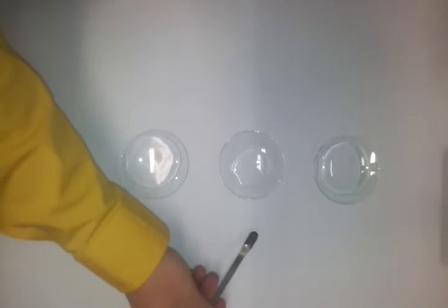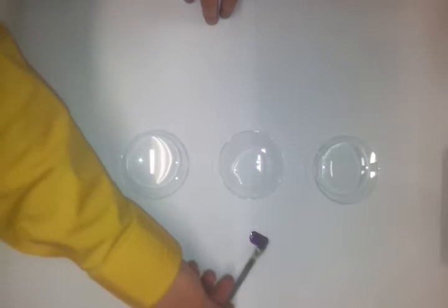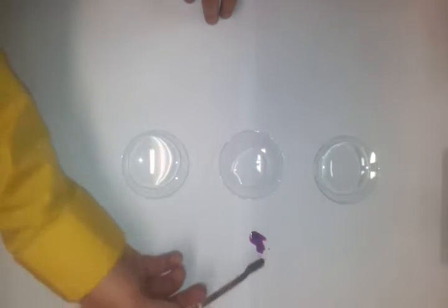Spread that out. On the video it looks very black, I see. Okay, so it's quite a cool purple colour. We're going to see what happens to that purple colour when we put it with these solutions. And then I'm going to go through how we write the balanced equations for each of these, because they are going to be a little bit different.